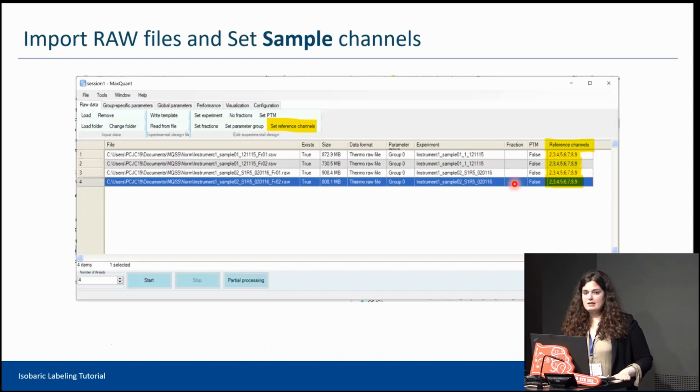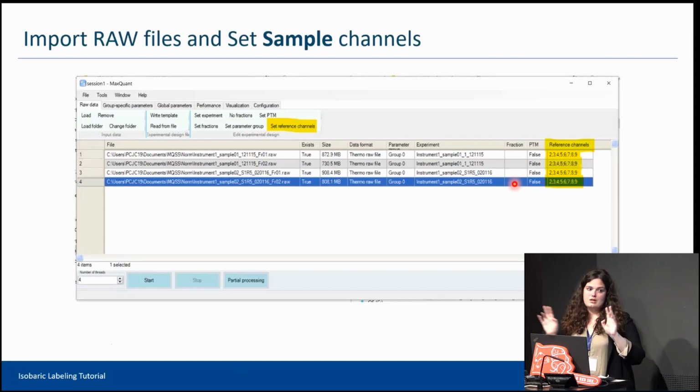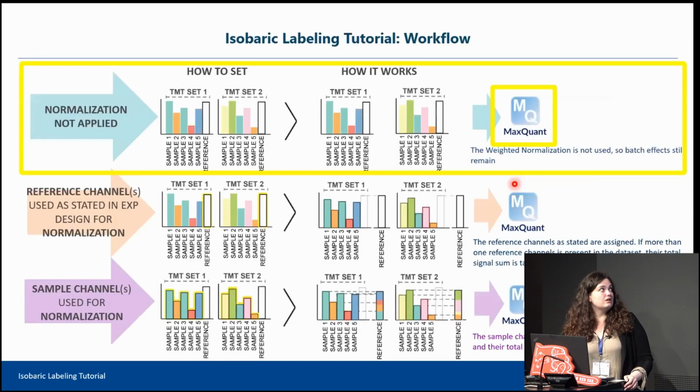This is another process: you open MaxQuant again, load your data as usual, and just this one is a difference, you process. That's it.